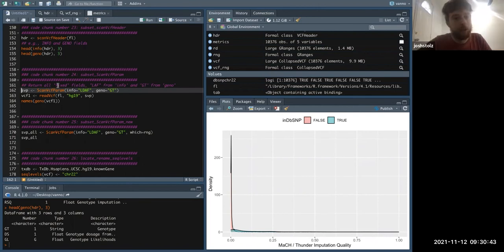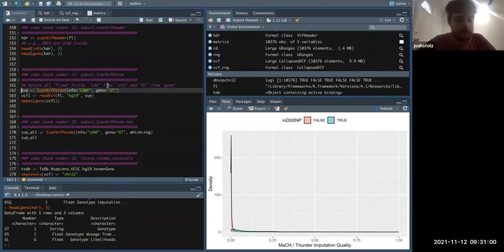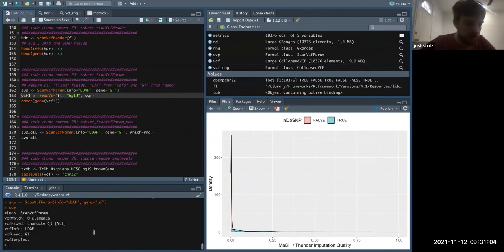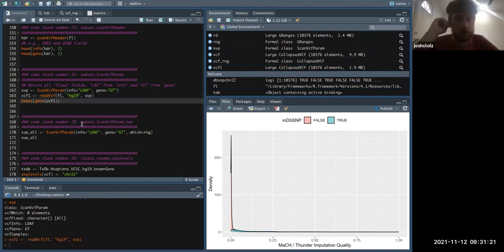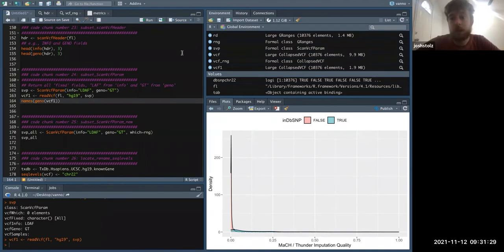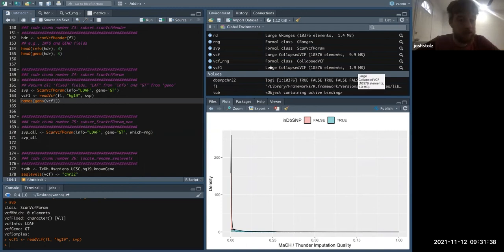We're creating almost an index — we're subsetting for two fields: we want the genotypes and within the info section we want allele frequency. When this reads in it's not going to read in the entire VCF; instead of subsetting by row ranges, it's going to subset by the two fields we asked for. This could also be a solution to our memory problems — our original VCF was 10 megabytes and we've reduced this to 1.9 megabytes, while still having all the genotype information needed for most analysis.